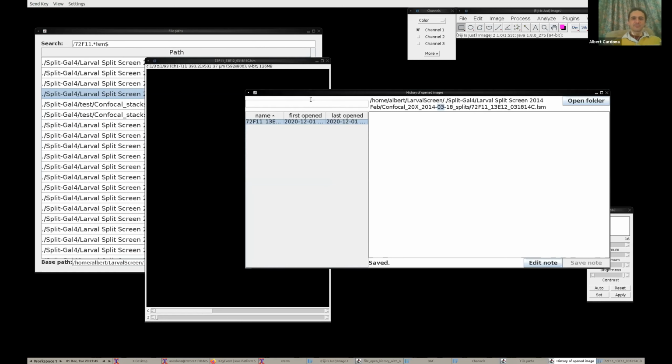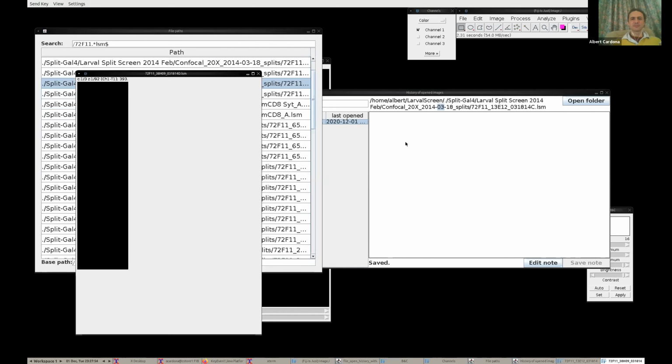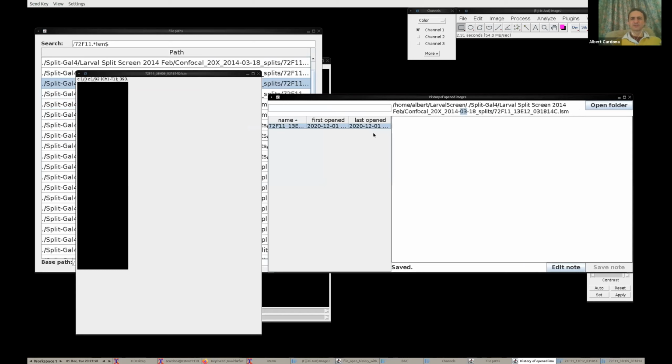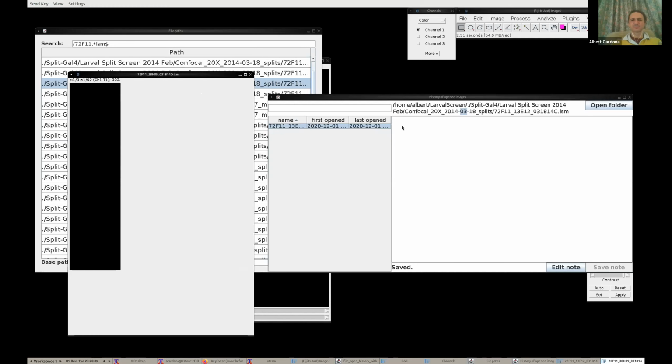So what this will do now, if I go and open, say, the next file, let's open this one. So there it is, 2 files, and in principle here, there should be another row. Did this file not finish opening? What exactly happened now? Sorry.